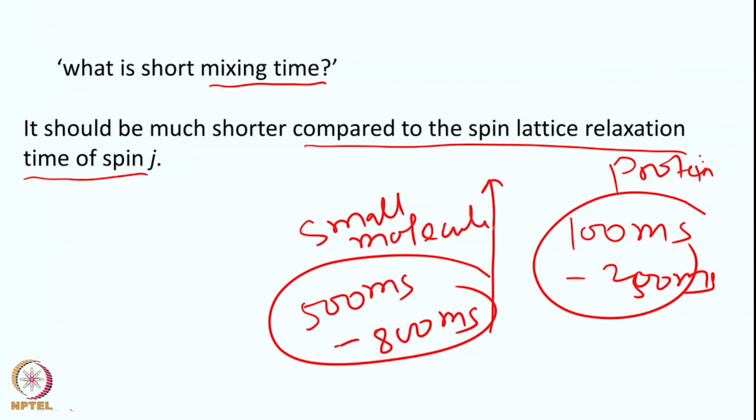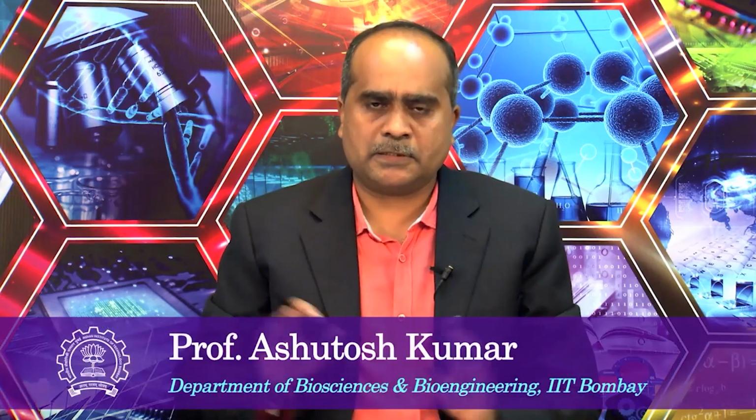These concepts are used in NOE. In the next class, I will take you through these concepts of magnetization transfer or polarization transfer, and how they are used as a measurement of distance by a few experiments such as NOESY. Briefly I will introduce you, and then we will go to heteronuclear polarization transfer by a concept called INEPT transfer. So, we will continue with this.